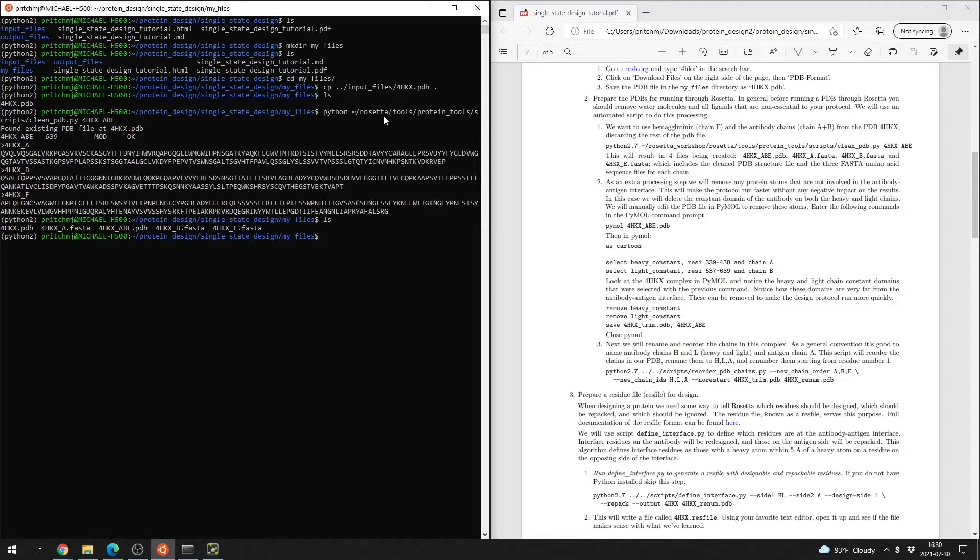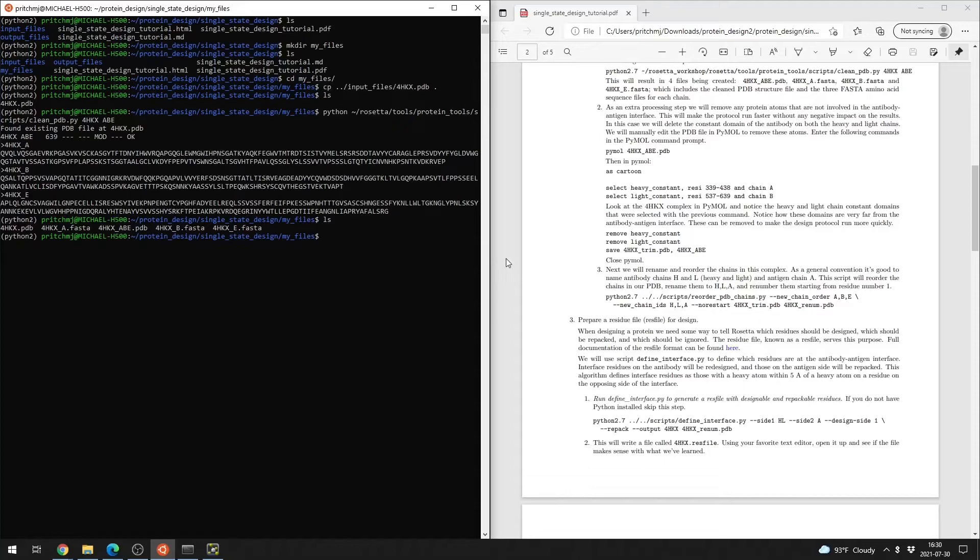We can now see that we have four new files: the cleaned PDB, and FASTA files for each of the three chains.